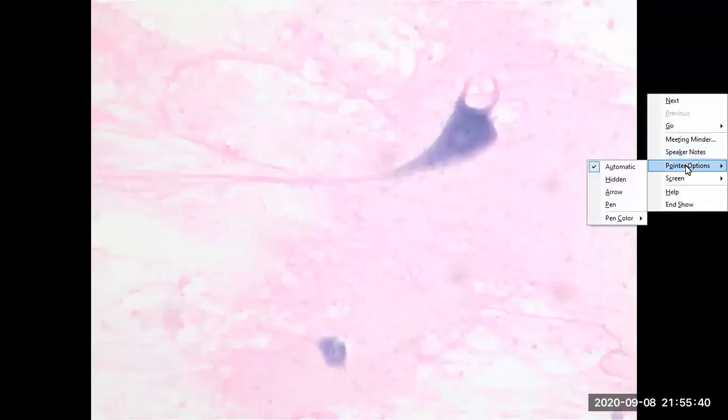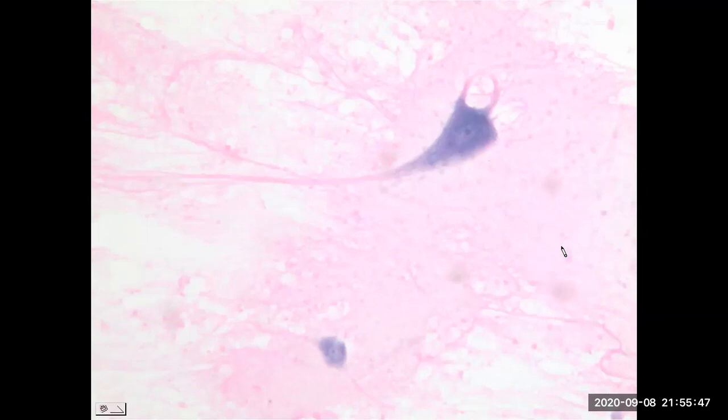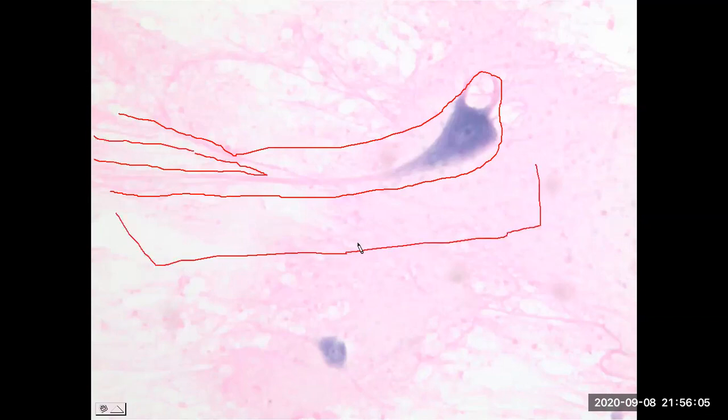All right, we're moving in now to nervous tissue or neural tissue. And we have our first sample here. So beginning with the term neuron, also known as a nerve cell, we have a great view here of one. I'll just highlight this entire area. So this entire cell here is one neuron. One particular type of neuron.